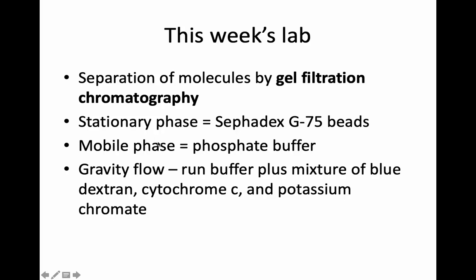So this is exactly what we're going to do today. We're going to apply gel filtration chromatography. We're going to use these SEPHADEX G75 beads as your column material.